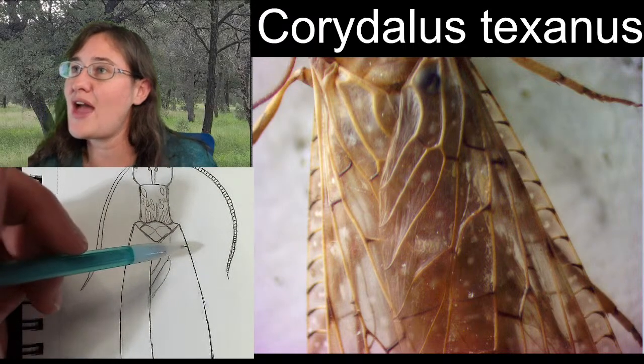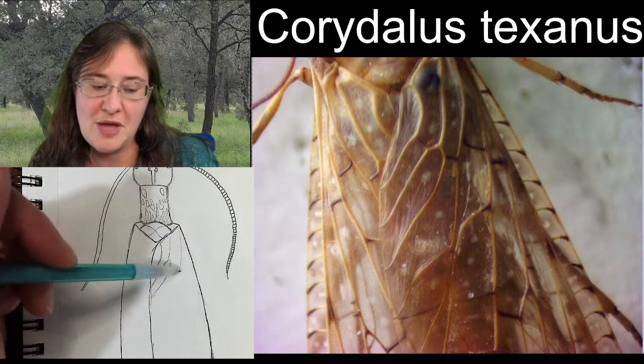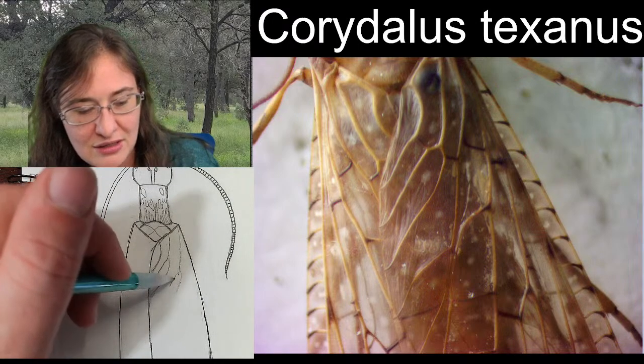And then we have another one. Let's see, I need to click off of that. That comes up and around, and then it's going to fork too. Oh, man.